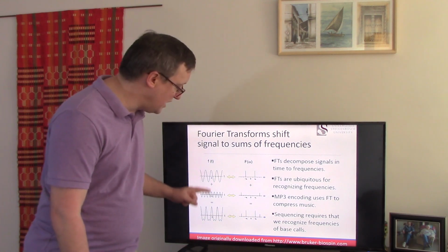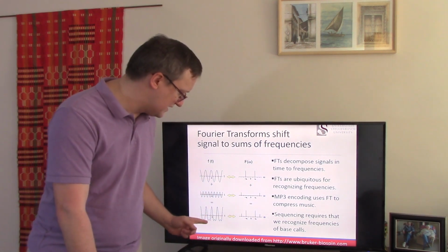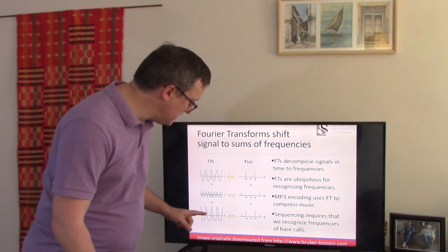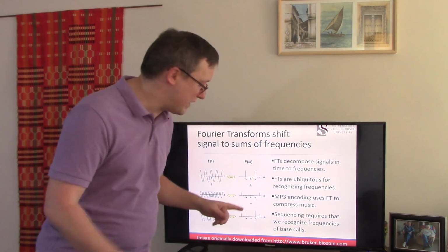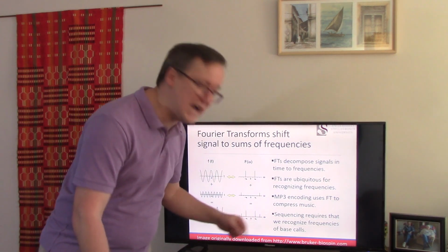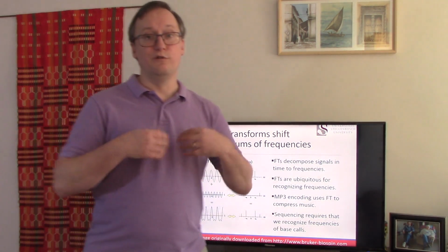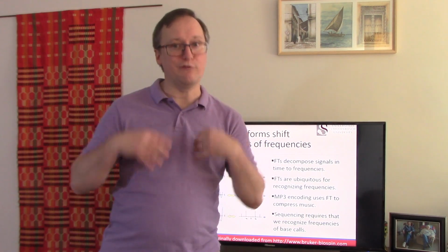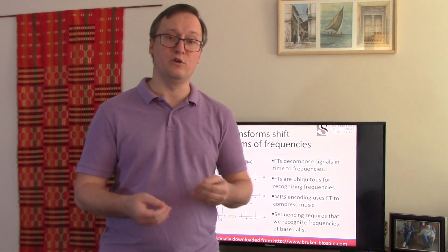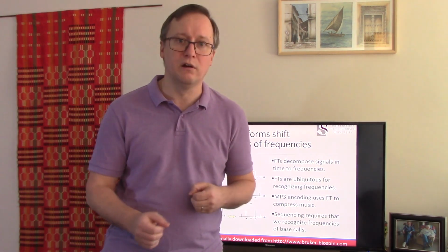Then when we see a complex waveform like this one down here, we see that this is actually the sum of these two waveforms. If you add each time sample here to each time sample here, you get this, a very complex looking waveform. But in the FT space, we are still able to detect that this signal is the sum of those two original waveforms. We see that it still has the relatively intense peak at this space and a higher frequency, lower amplitude signal further away from the origin. So Fourier transform represents our way of grabbing out frequencies from these time-dependent electropherogram signals. They in turn help us to discern the predictable spacing at which we should see peaks appear in the electropherogram.